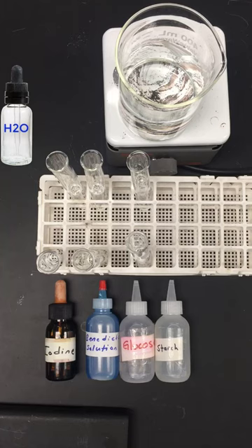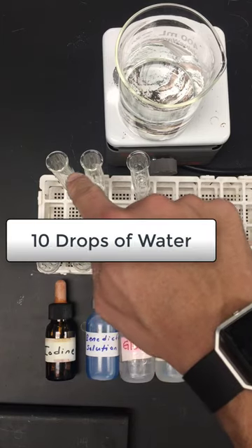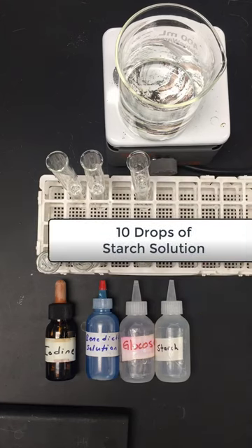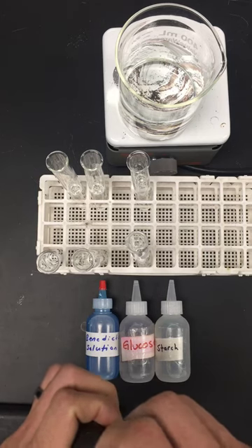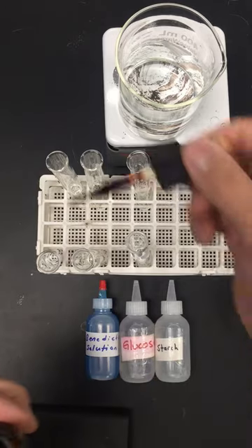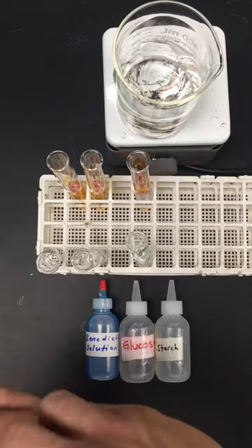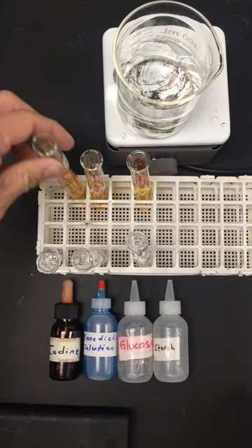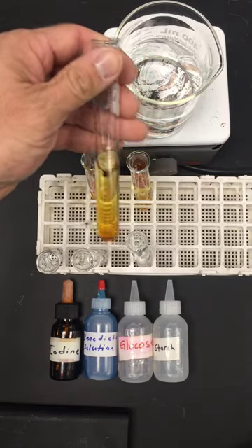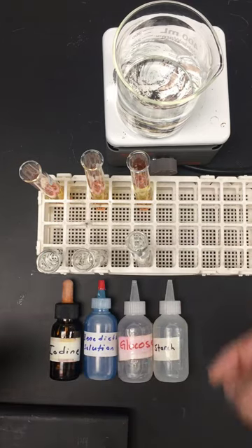For the first part of the lab, the starch indicator test, fill up one test tube with water, one with glucose solution, and one with starch solution. Then add your iodine — a few drops into each test tube. If there's a negative result, meaning no starch is indicated, you'll see the amber yellowish color. A positive test result will show a black-blue color change immediately.